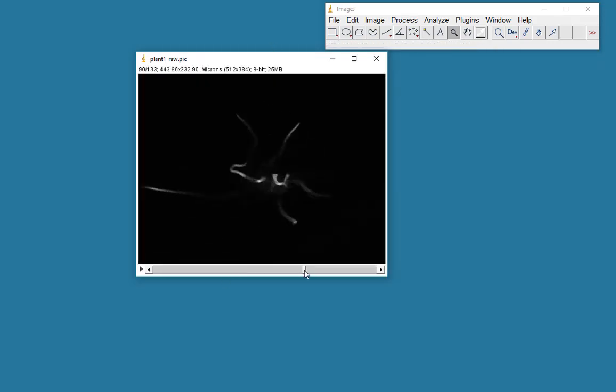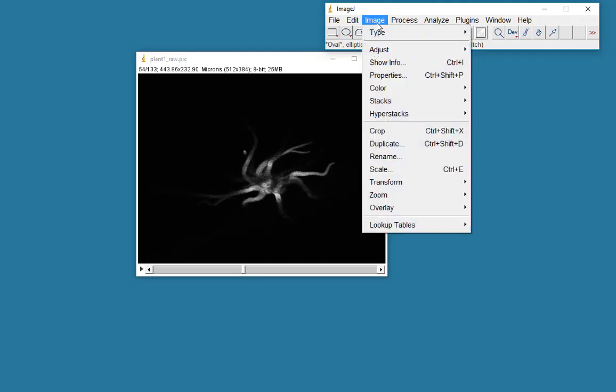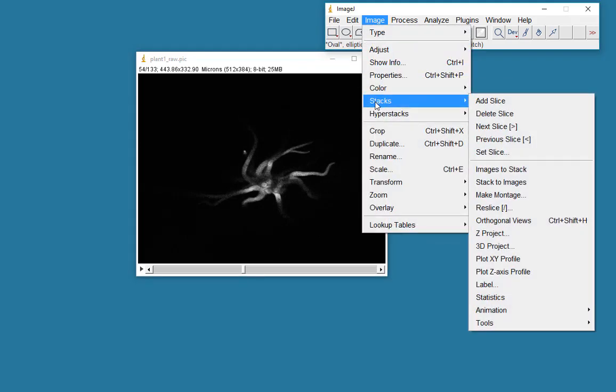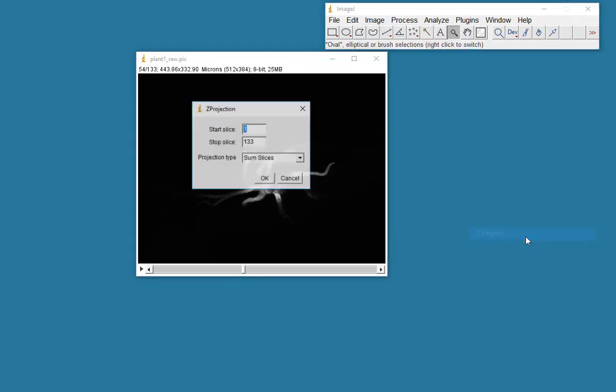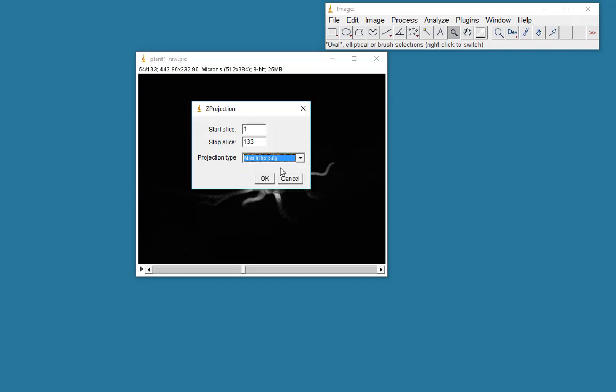Here's my Z series. I'm going to make a Z projection by going to Stacks, Z project. I'm going to start at slice 1, go to slice 133. And in this case, I'm going to take the maximum intensity projection.